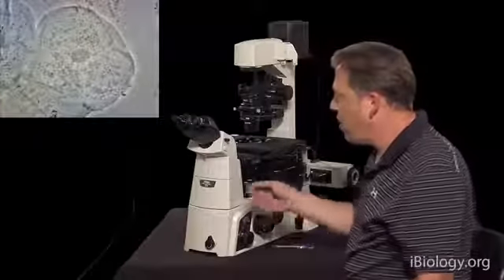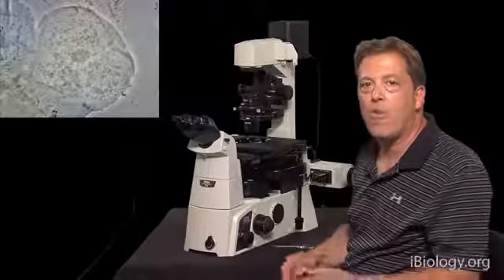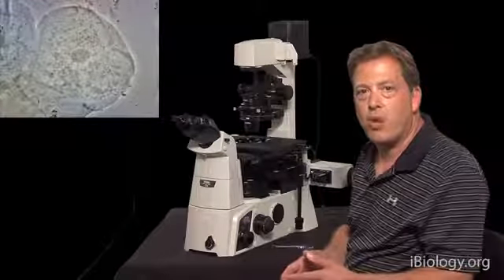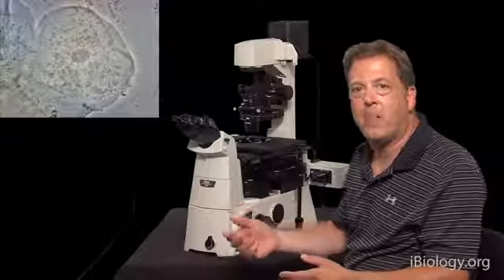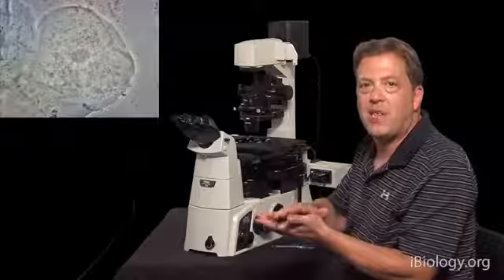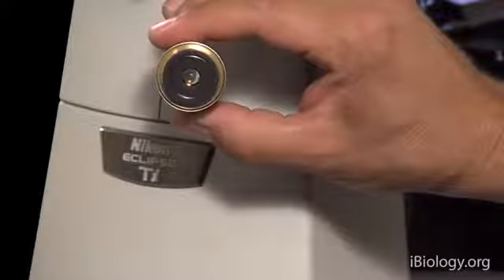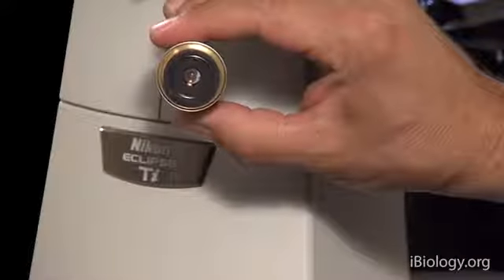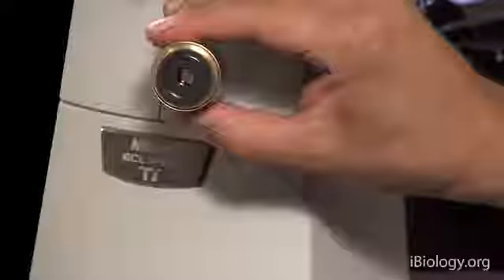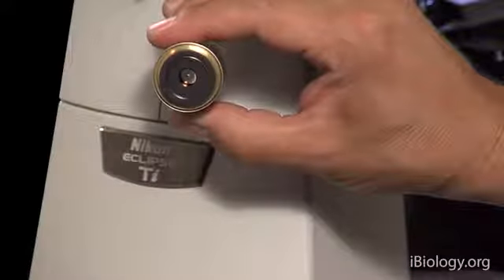Okay, so now what I'd like to do is talk about how you align phase contrast. So when we talk about phase contrast, we know that you have a phase ring made of a quarter wave plate and neutral density material inside the objective lens. If you look down the back aperture of the phase contrast objective, you can actually see that phase ring, which again is the ring of neutral density material and a quarter wave plate that acts to attenuate the zero order light that's basically your background.